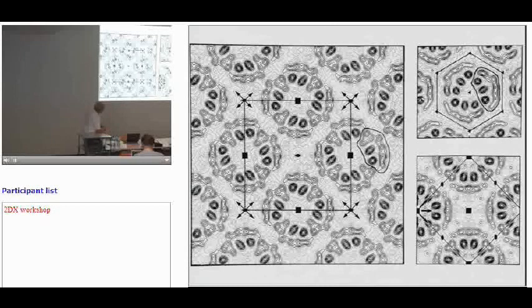And you can see this is bacteriorhodopsin, halorhodopsin. They are homologous, 30 or 40% homologous. So by having all the spots, we managed to correct our mistake. We put all the weak spots in and got the right space group, and then retracted it and resubmitted it. So we avoided having our reputation shredded.